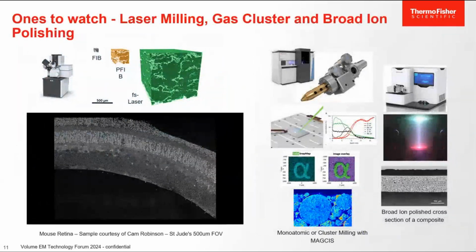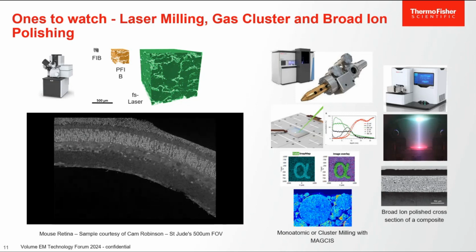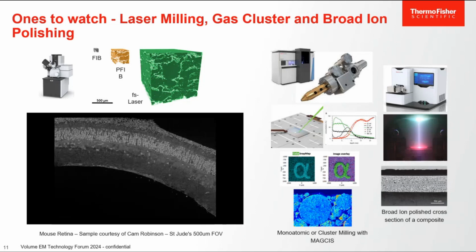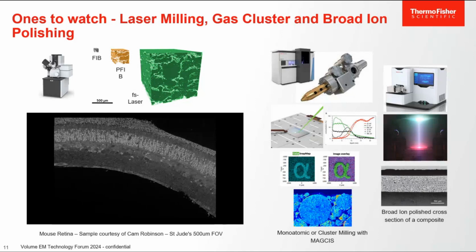So I guess just at the end, I wanted to say what ones to watch. One of the things that we're interested in is the application of lasers. So at the top left there, you can see we have a laser FIB. I'm going to play a movie here, which is a slice and view volume cut with lasers. The milling time here is fractions of a second, so it's really a very brief exposure with a femtosecond laser, and then you image, and then same again, rinse, repeat. You can build up a volume with that.